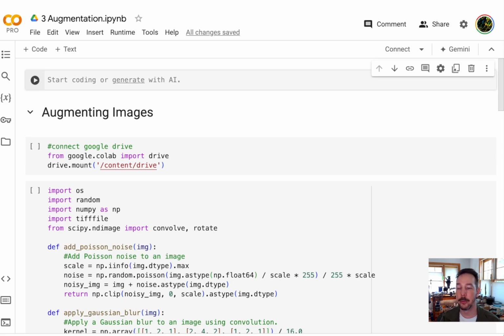But I would encourage you that after you finish with this workshop, especially if you're working with data that is noisy, or you're trying to increase the speed of your experiments, or you're working in live tissue or live cells, I would certainly encourage you to create your own training data sets based on the knowledge that you've gained from this workshop. And then you can use this Colab workbook to train on your own data.